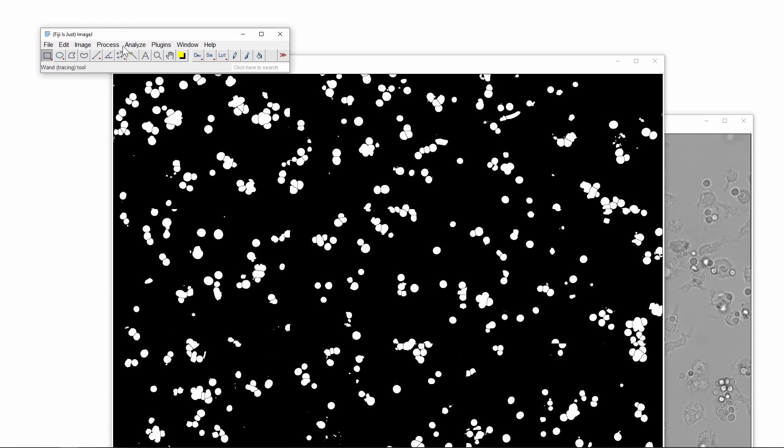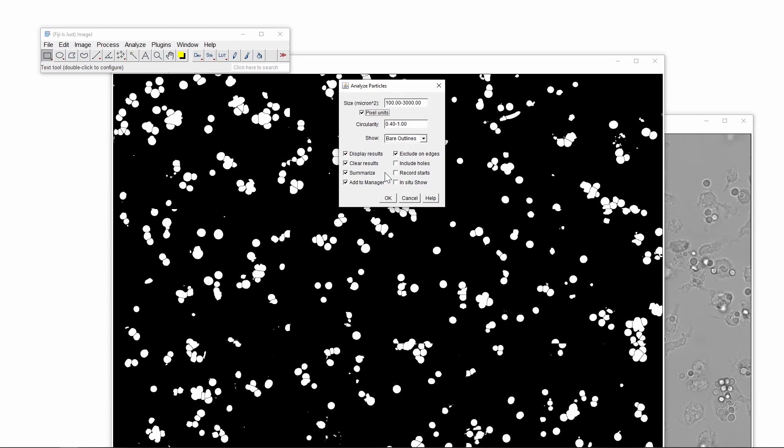Now we have a binary image on which we can apply the analyze particles function from ImageJ. This will identify the objects in a certain parameter range including size and circularity. Here we chose the values of 100 pixels for the minimum size, 3000 pixels for the maximum size, and 0.4 for the minimum circularity in order to focus our attention on the spores and not on other objects in the image.